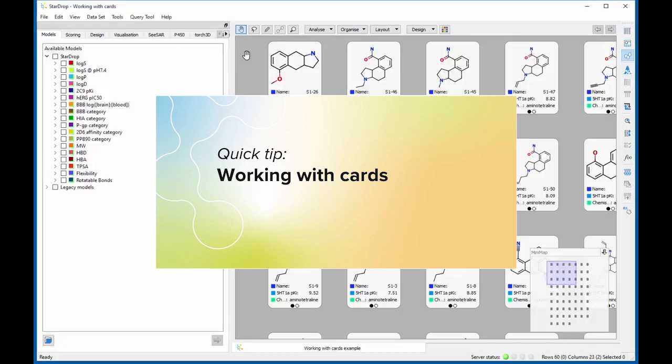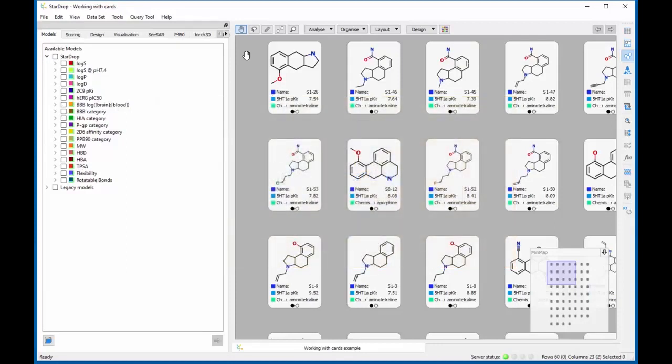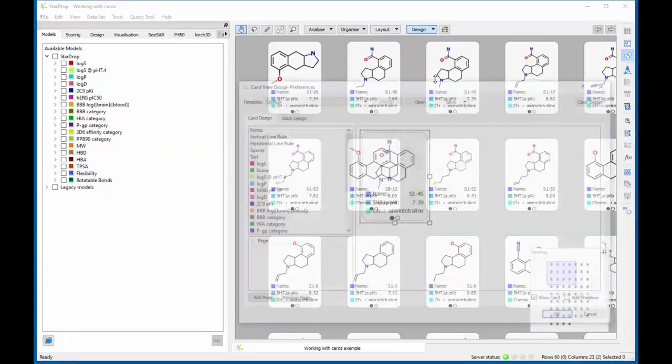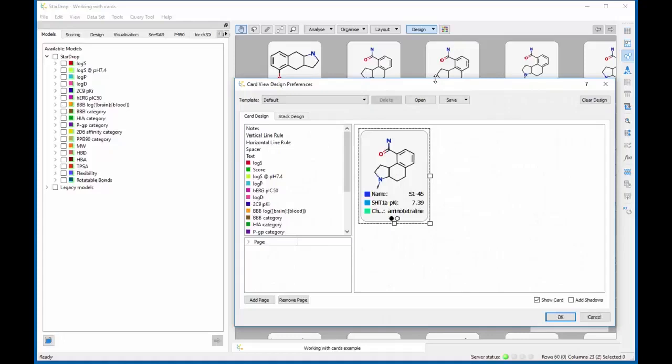As we have seen in previous videos, in Card View, each compound is represented by a card that can be moved and positioned as you wish. The default card shows the first columns of data in your dataset, but by selecting Custom from the Design menu, you can choose the information that you want to display for each compound and the layout in which they are shown.